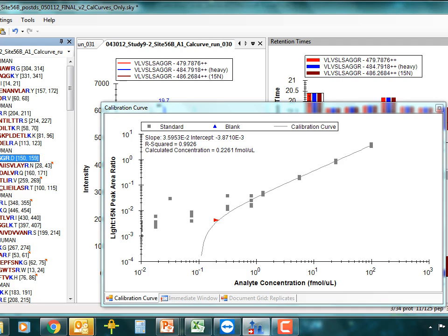So Brendan, here's a question for you. If you have two different internal standards and you want to look at it normalized to one and then normalized to the other, do you need to have two different saved Skyline files to do that? That's not anything we were, not anything that they told us they needed, so. Okay. Nothing but what we have.